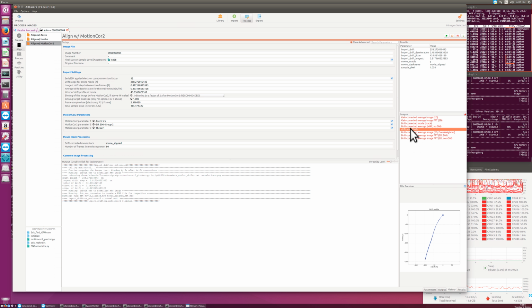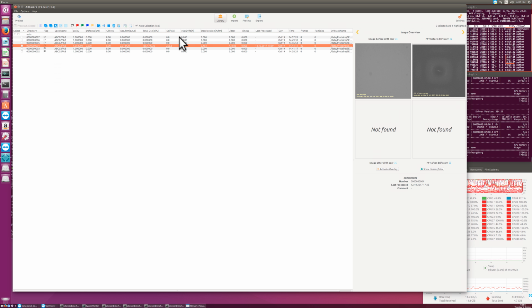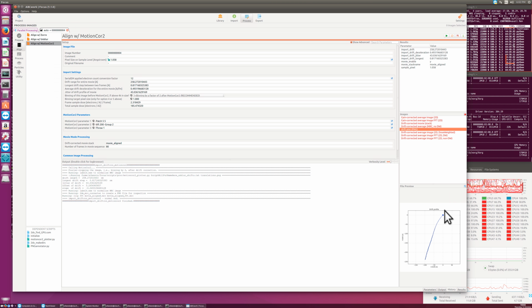There's a drift plot that we produce with a little Python script. You can see it starts, drift starts here and then is fast and then slows down, as we all know. And there's a total length of this trajectory, and then there's a deceleration. It should decelerate. If we go into the library, we now see that the total drift length and the max drift per step and the deceleration, so is all computed. And the jitteriness is a low value in this case. That is if this line is going in zigzag or if it's rather straight. So this is rather straight.